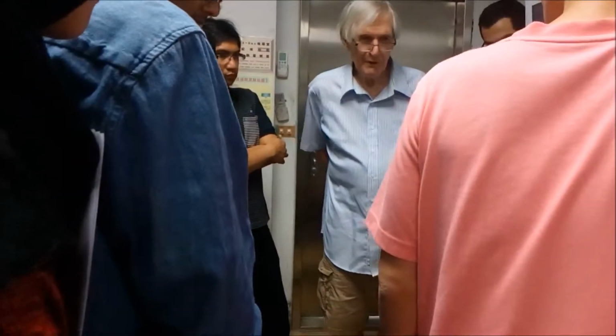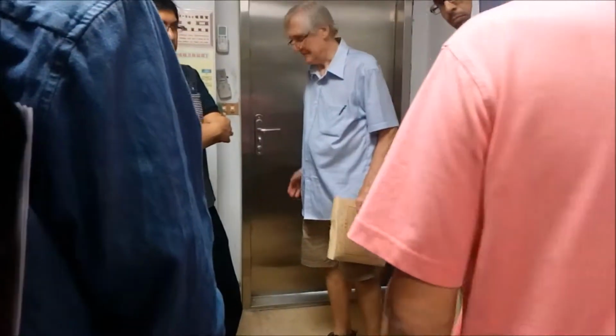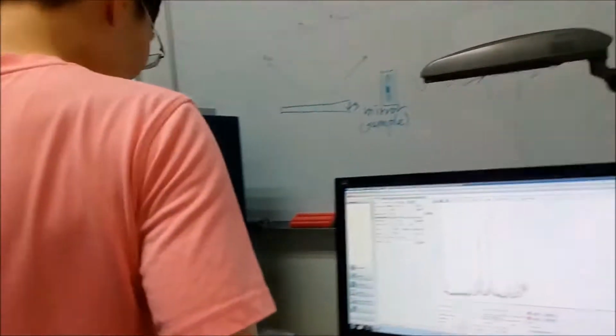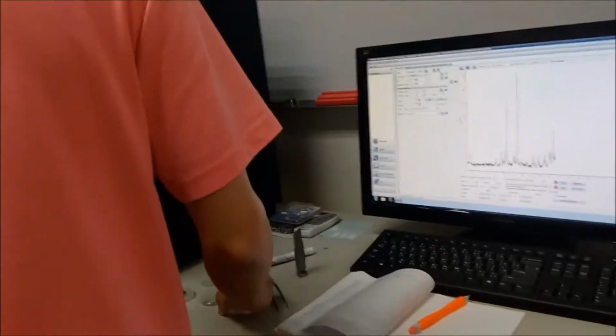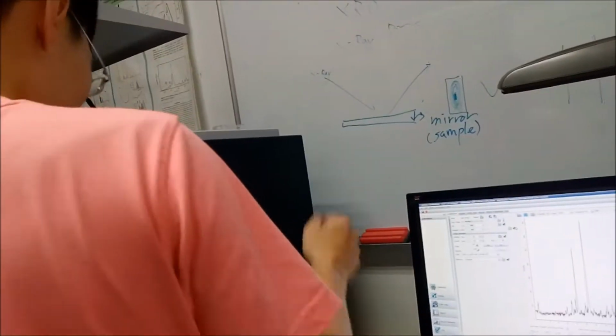Remember, this is all powder X-ray diffraction. So you have a powder material, not a single crystal, just a powder. Yeah, these two are different. So we use the powder to see all of this, what we call the crystalline phases.